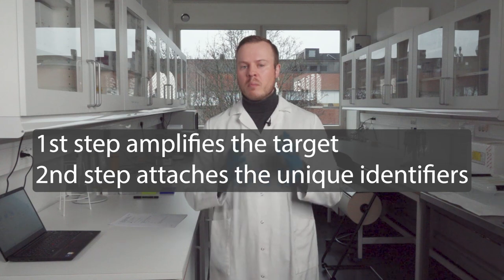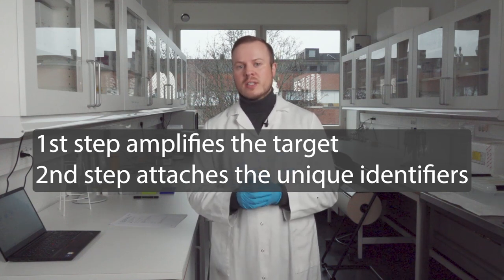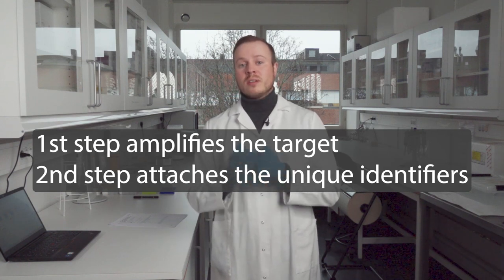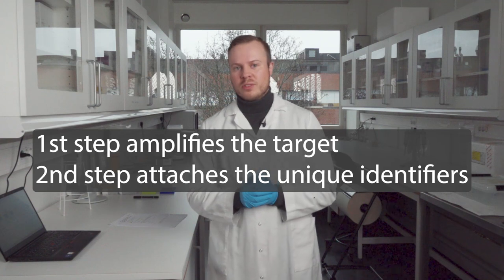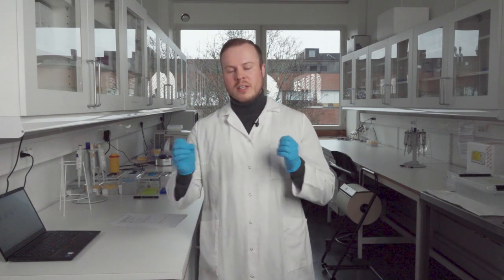Now to the procedure itself. We use a two-step PCR procedure where the first step amplifies the target we are interested in, and the second step attaches the index primer that lets us trace back the DNA to the given samples. The reason we use a two-step PCR is that it gives us a lot of flexibility when it comes to finding and switching between different targets.